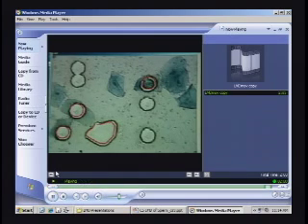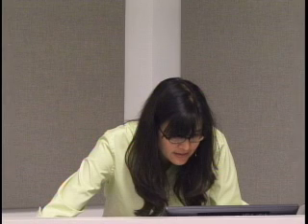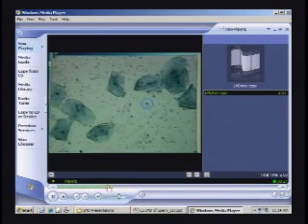Now we will be focused on cutting sperm, but you'll have the opportunity if you want to cut epithelial cells. I don't know why it's skipped over a certain part. Let me just try to find it. Okay, yeah, this is just the sperm. Somehow it skipped over this part, or I didn't see it. This was just the sperm cells being cut out.